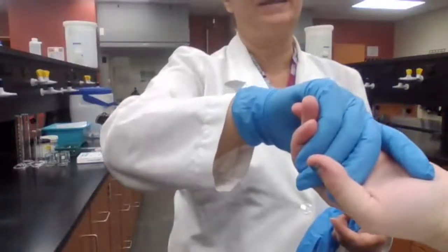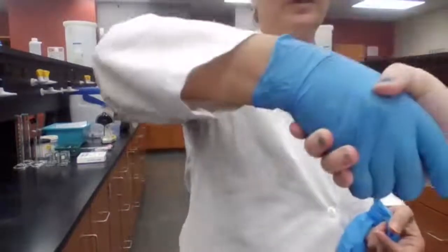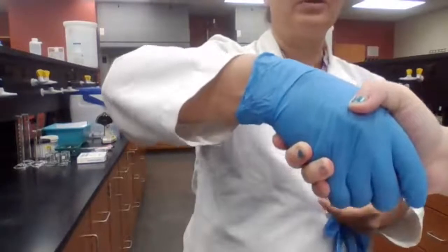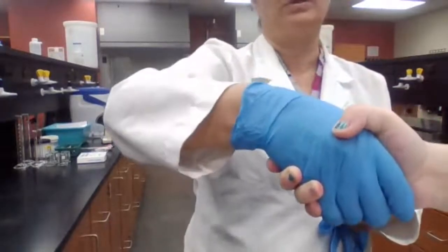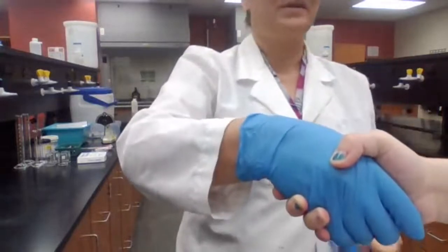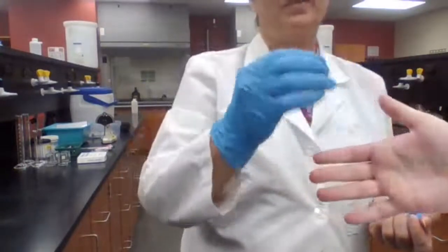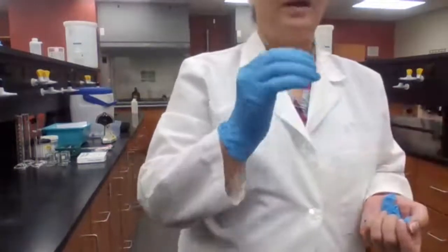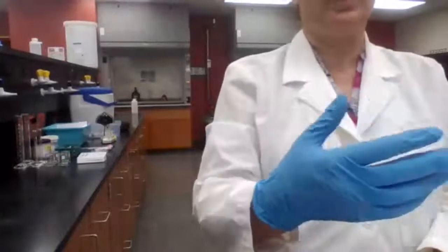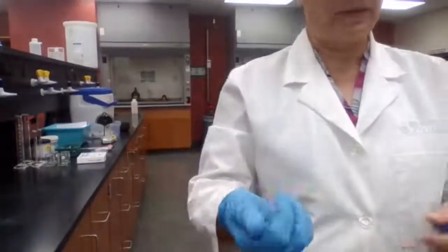Let's say the tartaric acid is coming together with the negative enantiomer of the amine that we are going to form. The bond is going to form, and it's going to be a strong bond, so the crystals are going to be more stable. But the positive enantiomer of that amine is going to form a bond too, and for the positive one it is not going to be a strong bond.